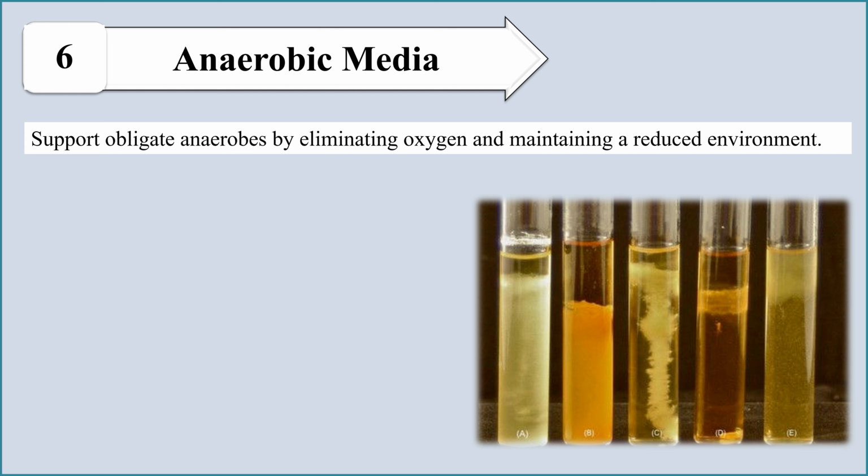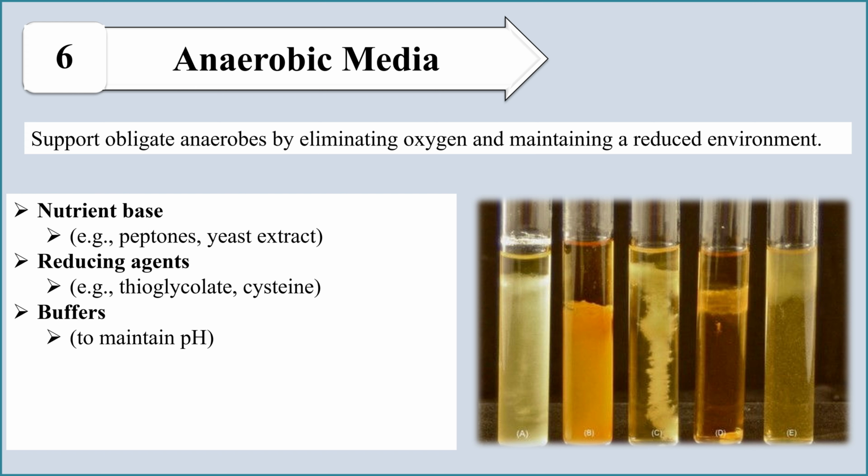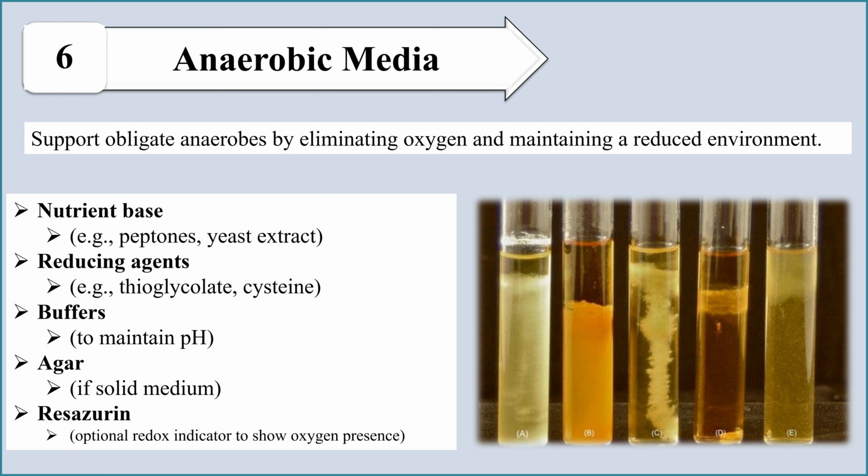So what are the nutrients that are used in this media? These are nutrient base like peptones or yeast extract. Reducing agents in such types of media are thioglycolate and sometimes cysteine. Buffers are used to maintain the pH. Agar is used for the solid medium, and resazurin is optional. In some media, it is used as a redox indicator to show the oxygen presence.